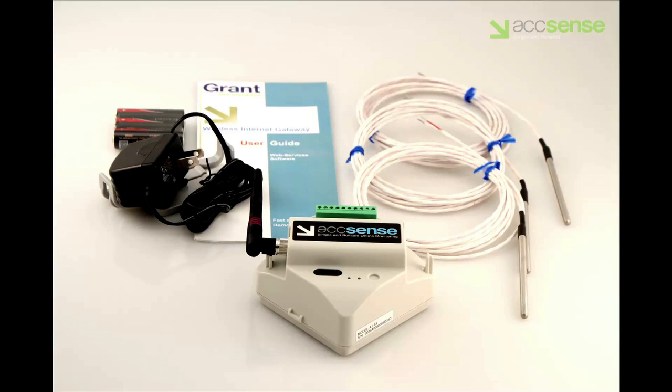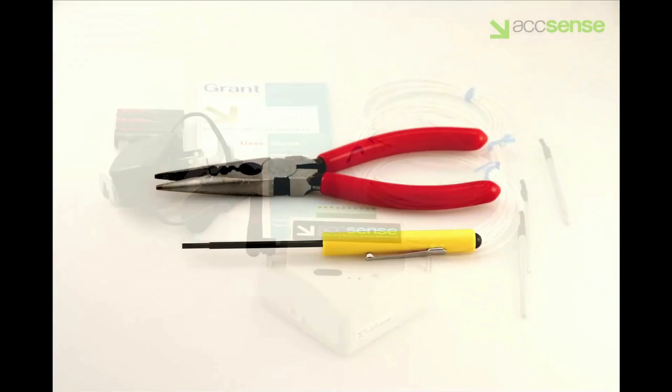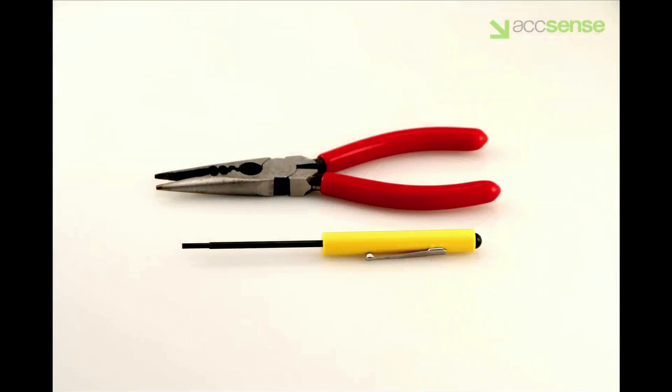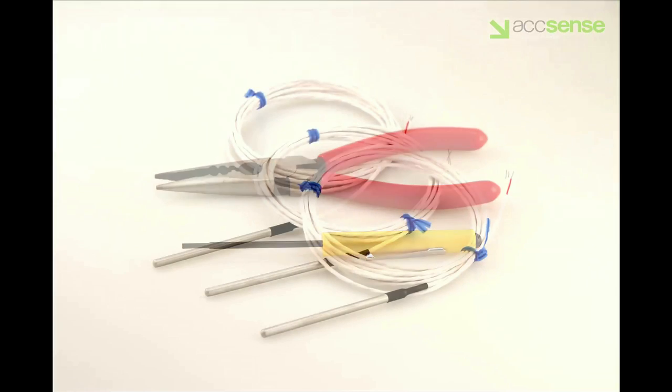In addition, you'll need the probes that you'll be hooking up. The A113 will accept up to three of them. The only tools required are a screwdriver and a pair of needle-nosed pliers with side cutters.